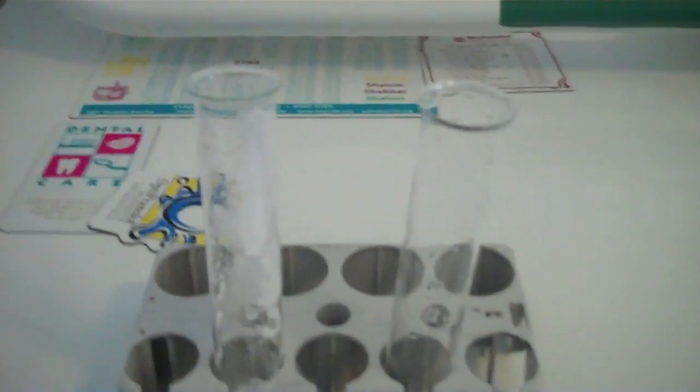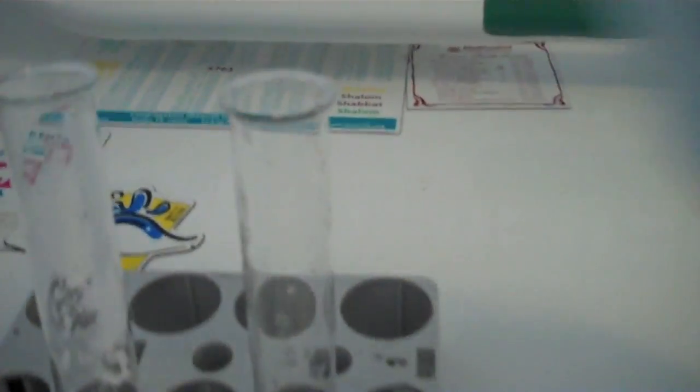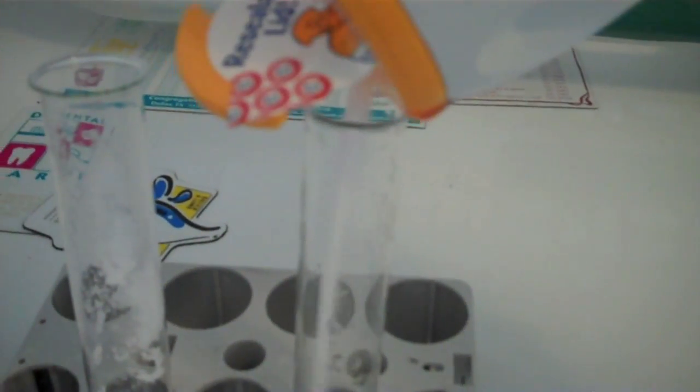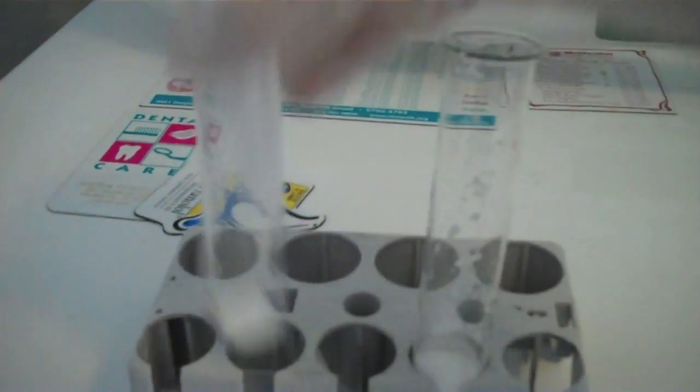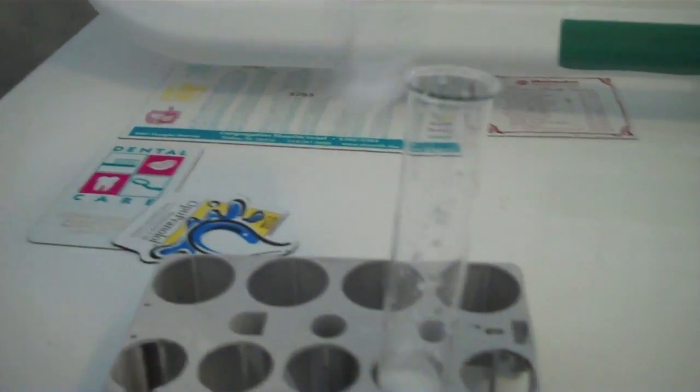So this is my sample of sodium carbonate I've made, and in this test tube I'm going to place some sodium hydrogen carbonate. Now I'm going to place a little bit of pH indicator.